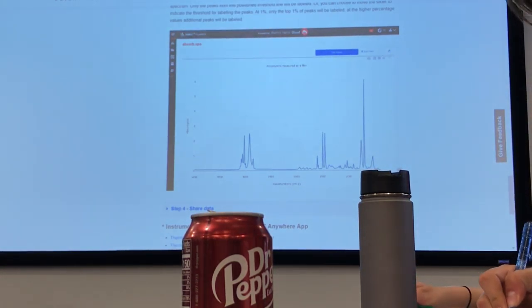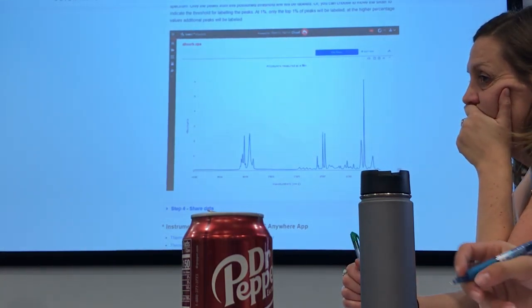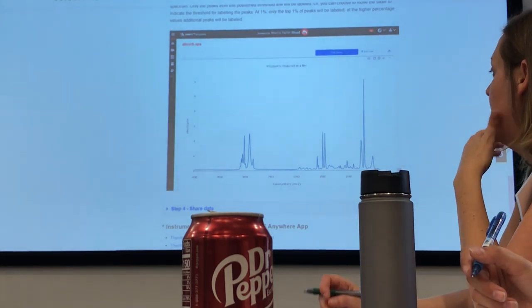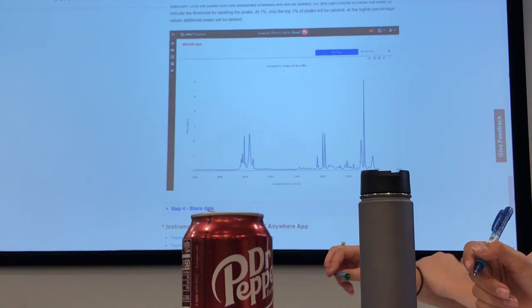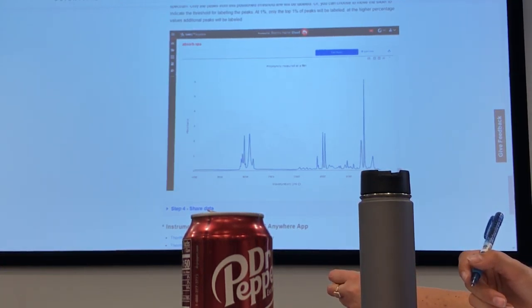Even if you're doing a lot of imaging or microscopy work, the images you're going to save as .jpg, so you can open them anywhere. You have nothing to worry about; it's only for the data files. The other option you can always use is to save the data as .csv, then import it into Excel and open that. So that's also an option.